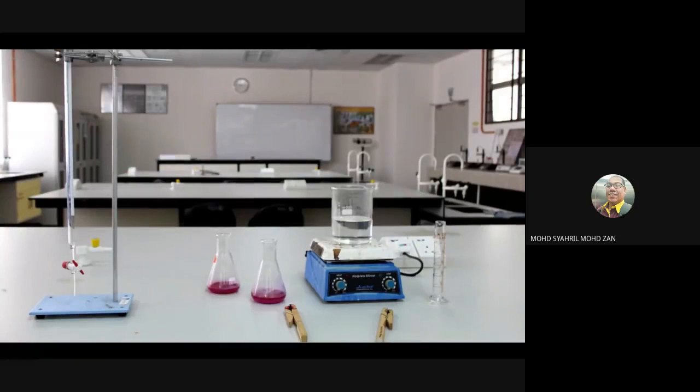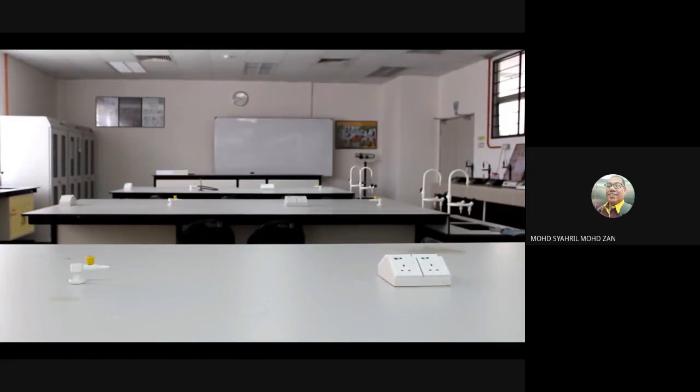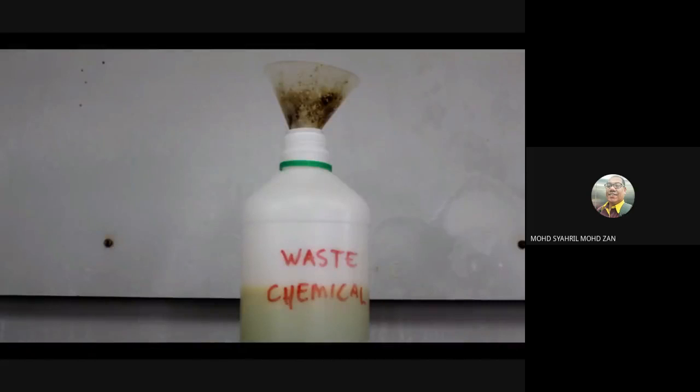Clean all the instrument and our workstation used in the experiment to ensure the cleanliness. Make sure to discard all waste chemicals into the waste bin. This is because chemicals are toxic and may be corrosive.